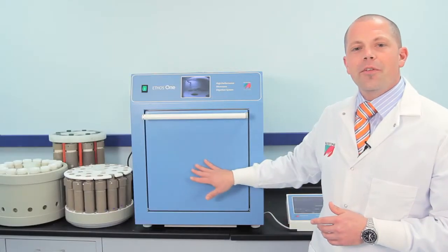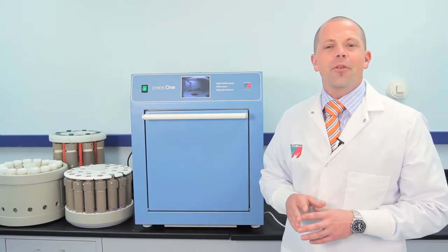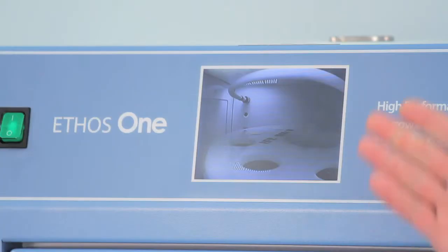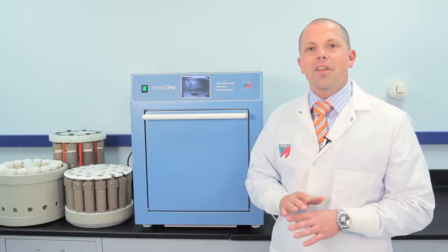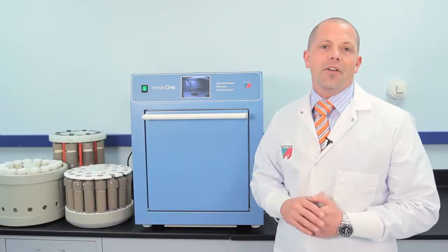Note, there is no viewing window in the door. That's because the Ethos One is fitted with a camera that allows the user to monitor the run in progress. Additionally, a video of the entire digestion run can be recorded and saved.